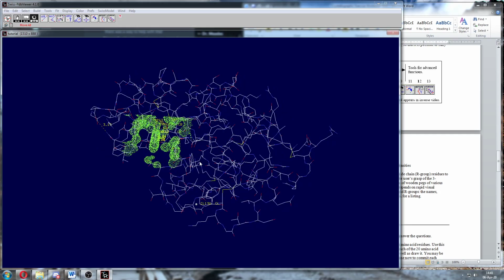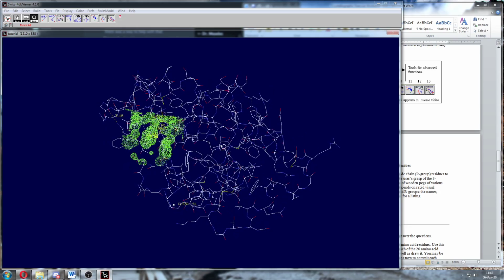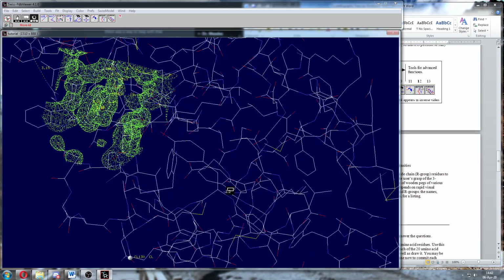Okay. So now let's go find our tryptophan again. I'm going to pick a different tryptophan this time to show you how I can move over there. So let's find another one. How about this one right there? All right, so I'm going to zoom in on it.